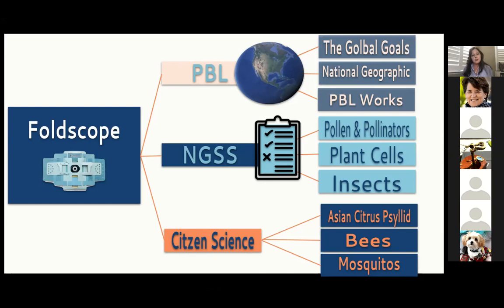is connecting it to project-based learning. I'll talk a little bit about the global goals. Oh, I got a misspelled word there. The National Geographic resources, project-based learning, and then three big ideas with pollen and pollinators. I went over plants already, insects, of course, and then citizen science with the Asian citrus psyllid, which is a local problem for us, bees and mosquitoes.